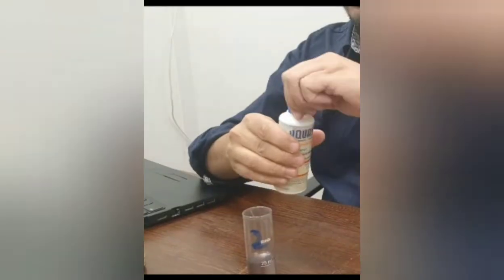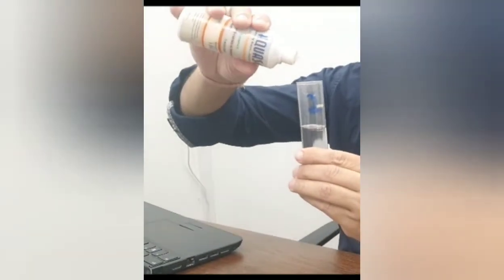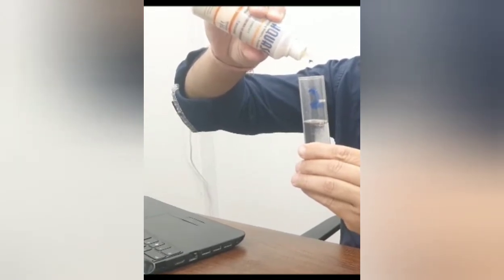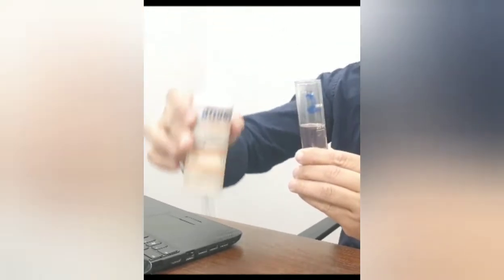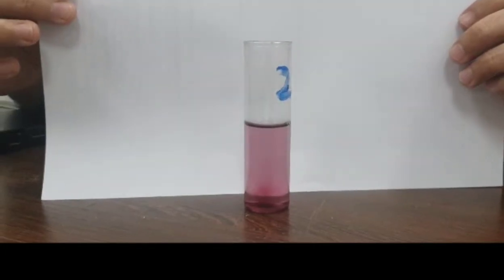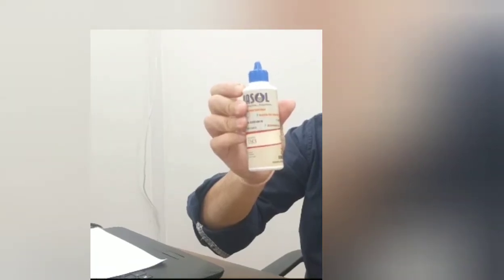We add 10 to 12 drops of TH2. If hardness is present in the water, the color will change from clear to pink. After addition of 10 to 12 drops, shake it to mix well. Here you can see the color has changed to pink, confirming hardness is present. To estimate the level of hardness, we are taking the next reagent, TH3.